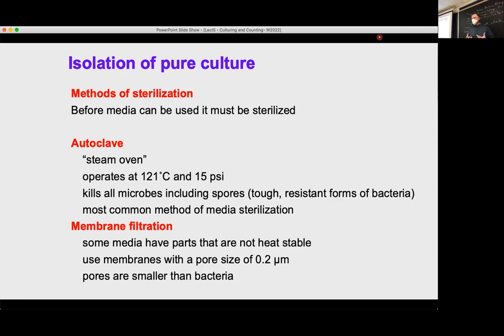The more complex your soup is, like let's say it's soil, you have to hold it much longer because the heat has to penetrate right to the center, right? So it might not be a 20 minute stay. It might be like an hour long stay if it's something that complicated.